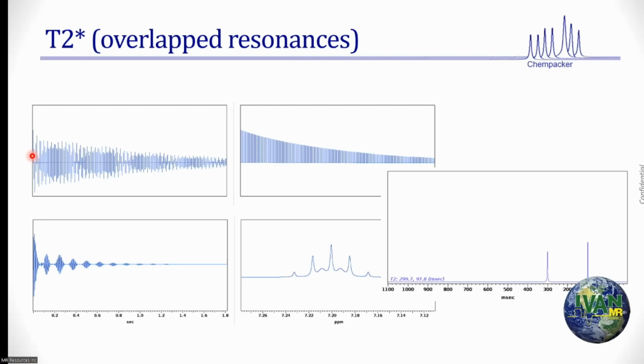Guess what would have happened? My phases would have gone all over the place. That's what happened there. The second line there is as though I collected the data 100 microseconds later, if it were a 1 microsecond dwell time. And then another 100, another 100, another 100. Guess what? If you just look at only the amplitude, that is your decay. That is the rate of change of amplitude because I'm going from dwell point 0 to 100, 200, 300, 400, 500. That's a decay of my amplitude.